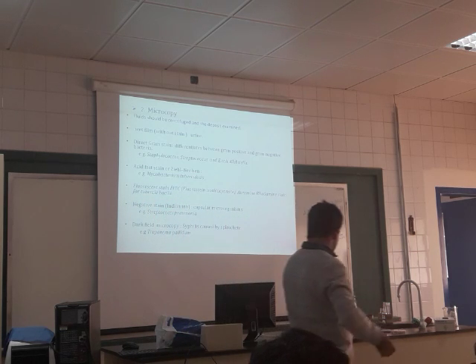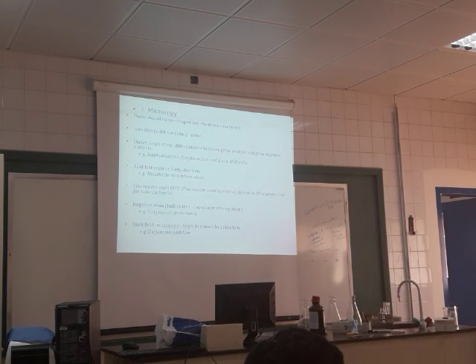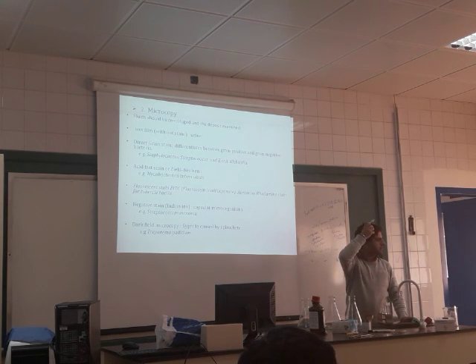What is a Gram stain? It is a stain that differentiates. What does this stain mainly contain? Color. What are the steps in the Gram stain? Steps to make the test.